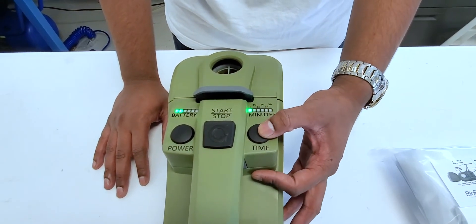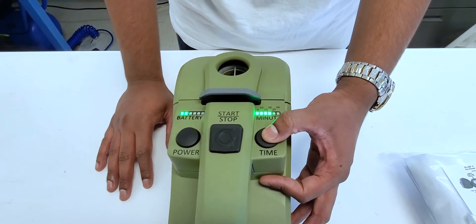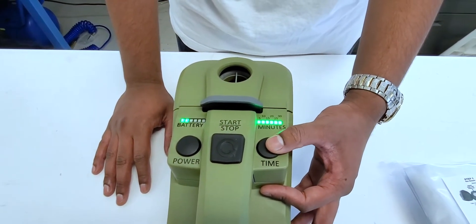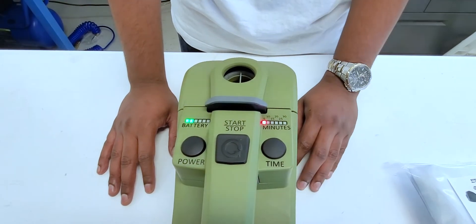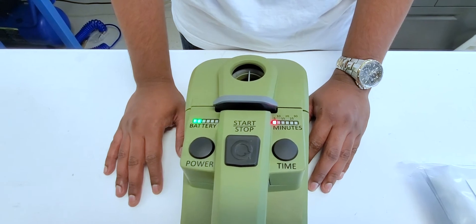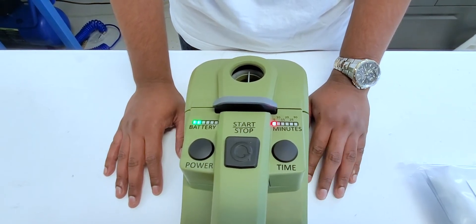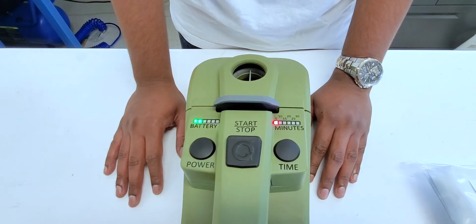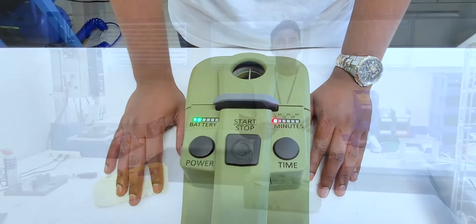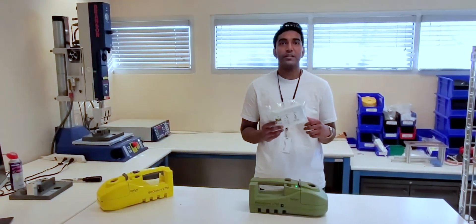On the right side of the instrument, we see where we'll be able to toggle the amount of time for our sample. We can go from five minutes up to 30 minutes in five minute intervals. If we press this button one more time, we'll see a red LED light up here. The red LED indicates that we are now running in max flow mode, which means that our sample has gone from 200 liters per minute to 500 liters per minute for five minutes of sample time. Now I'll be demonstrating how to run the instrument with one of our standard consumable kits.